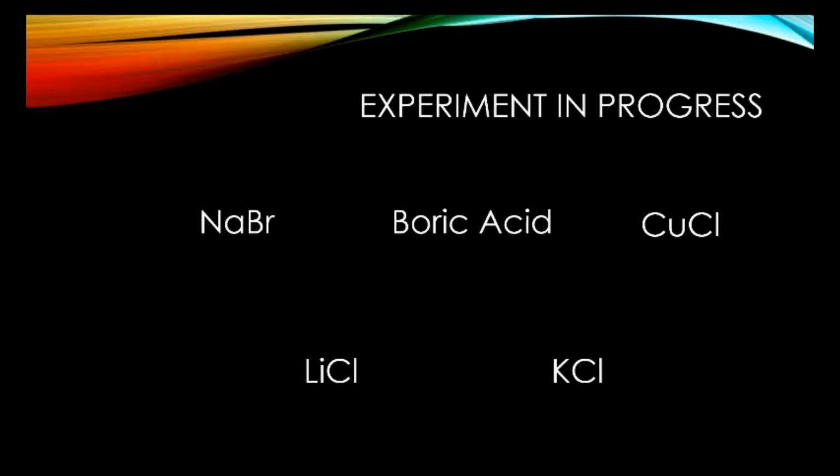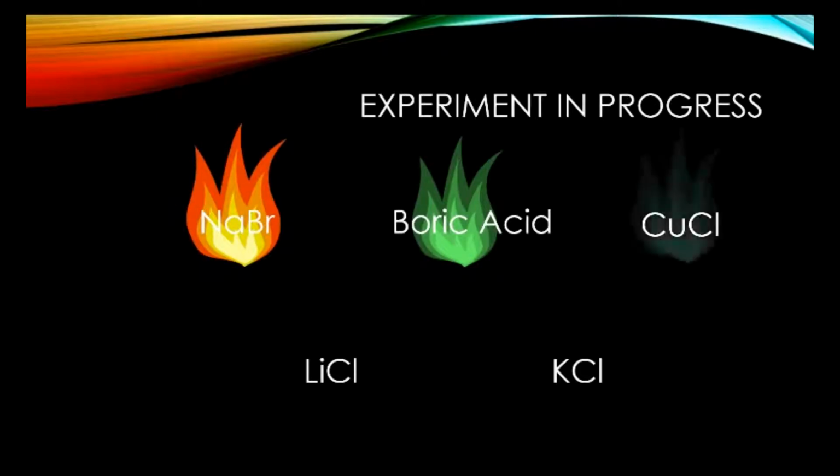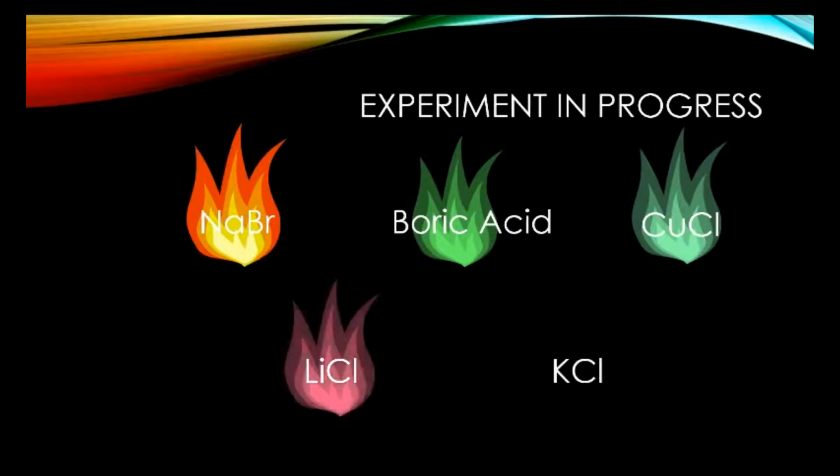As you have seen in the Faraday lecture videos, 5 compounds, sodium bromide, boric acid, copper chloride, lithium chloride, and potassium chloride, are all prepared in aqueous solutions. When sprayed into a flame, each compound will release a bright flash, changing the color of the flame.